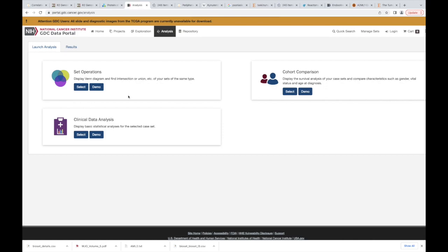You can do Venn diagrams, you can select lists, but for the most part I think it's kind of useless in my opinion. Not a very good place to go get data. All right. Any questions on TCGA?